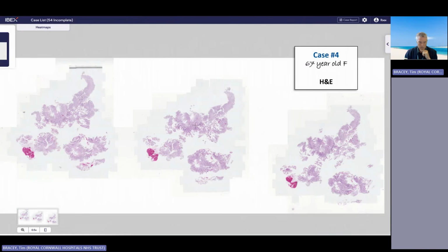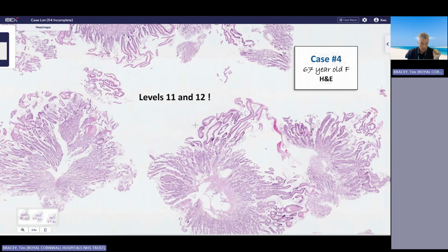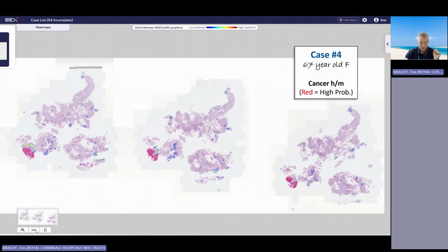And I went completely insane on this biopsy. I did 12 levels on it because I kept seeing this area in the middle of the biopsy that just looked like lymphangitis, but I couldn't see any tumour cells in it, but the vessels looked abnormal. I knew the patient had cancer, and they'd done a really good biopsy, so I thought, well, I've got to give it the benefit of the doubt, I'll just keep cutting. And on levels 11 and 12, I found this little area of blobs of fibrin here, and I think eventually on the 12th level, I found a few tumour cells in it.